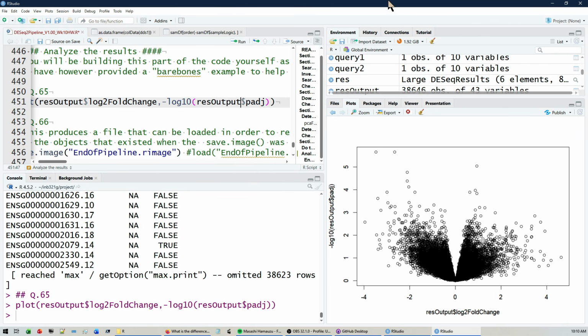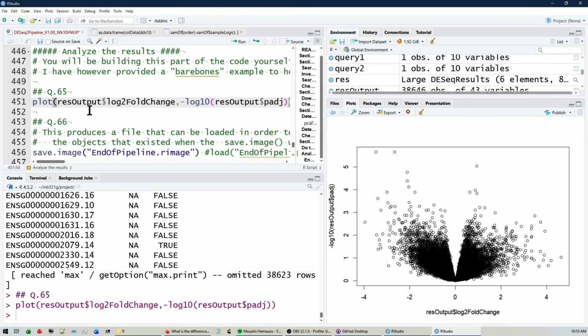This is just more to help you understand the direction that is going between your two groupings, as well as see the overall difference, which you're often more interested in and more trusting of larger overall differences. On the other hand, the p-value is statistically based, and it gives us more information in terms of, should I trust this from a mathematical, statistical perspective?